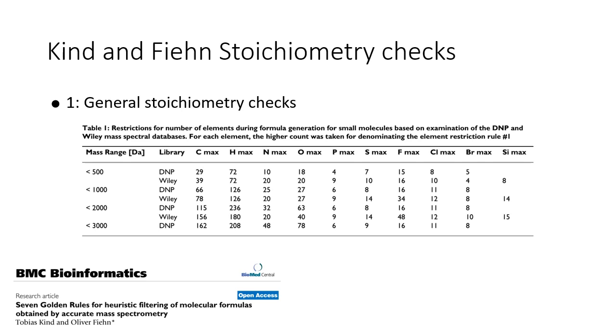So to pass this test, any potential formula needs to fit inside the stoichiometric envelope for the appropriate molecular mass range.